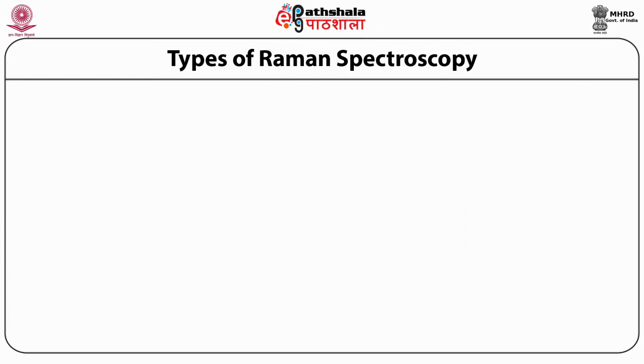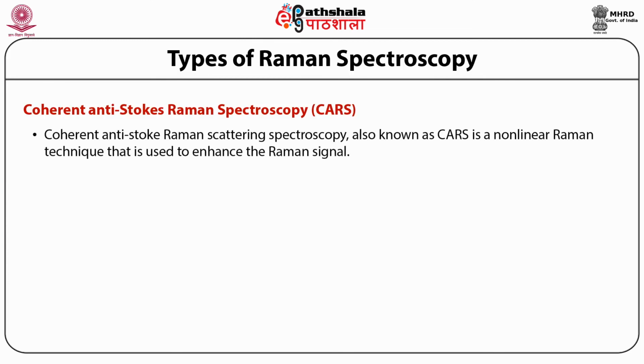Now, let us see the third type of Raman spectroscopy, which is called coherent anti-Stokes Raman spectroscopy, or CARS. CARS is a non-linear Raman technique that is used to enhance the Raman signal.